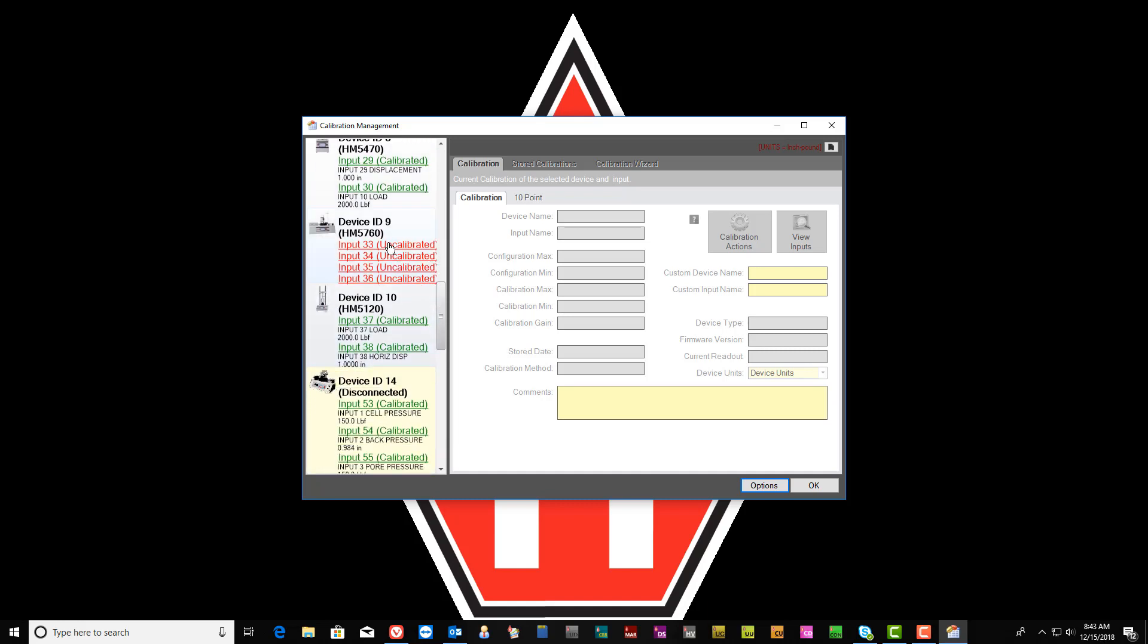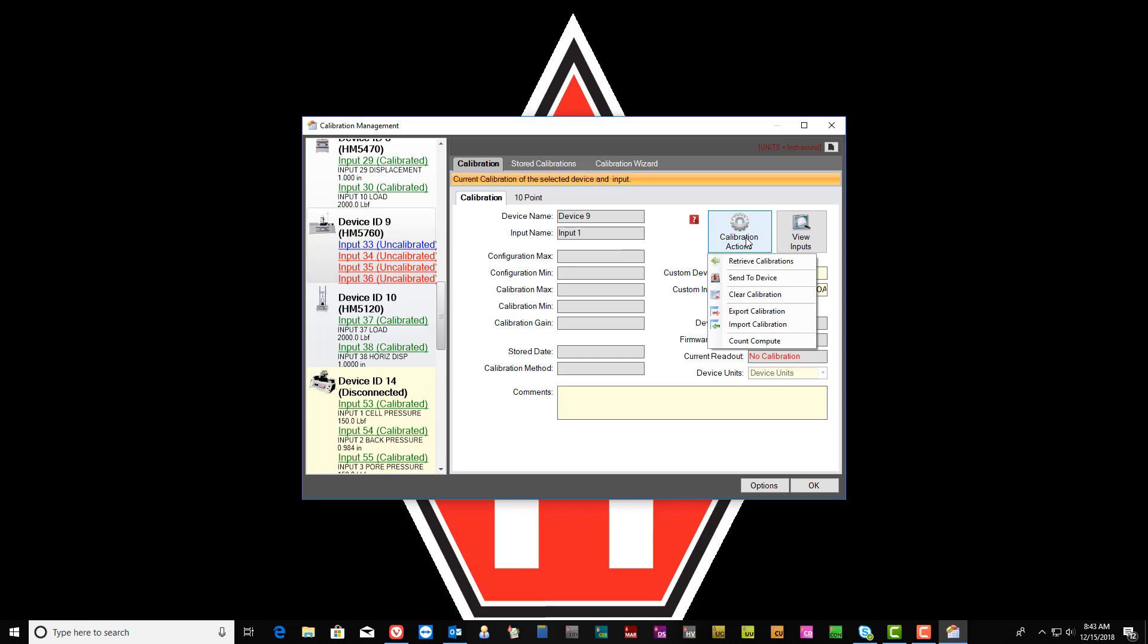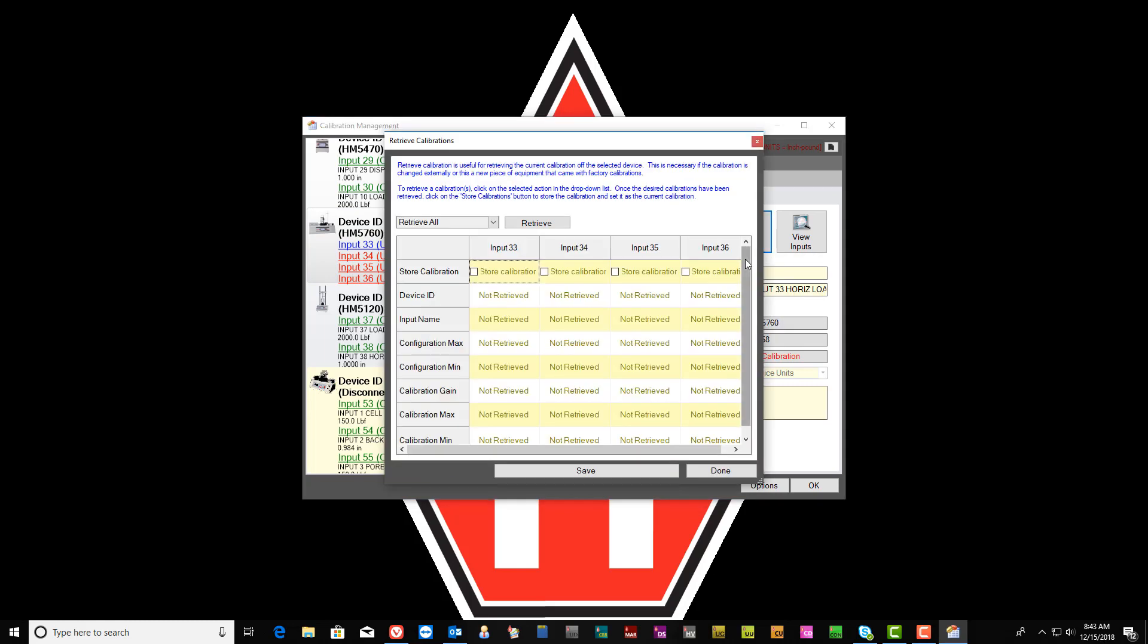Select one of the inputs under that device and then select Calibration Action. Within that window that appears, select Retrieve Calibrations.